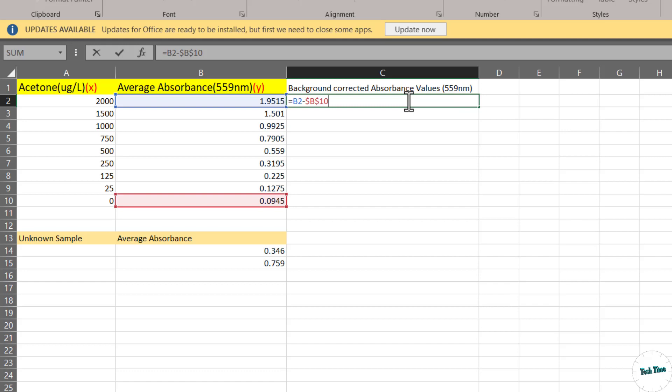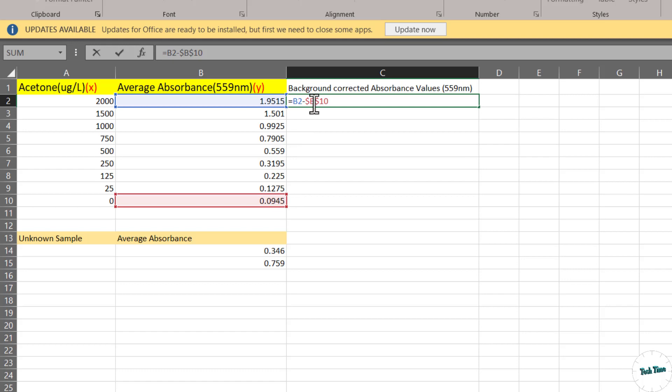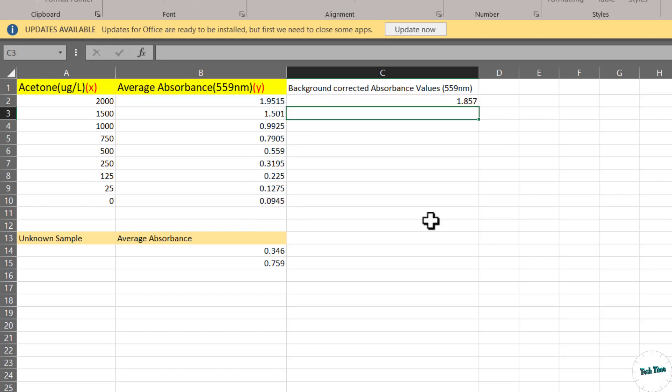The reason for inserting this dollar sign is to make this particular cell constant. If we don't do this, then using the drag function, Excel will take sequential values like if it's C B1, next it will take B2, B3 and so on. In order to fix this, you must use these dollar signs so that this particular cell remains fixed. Press enter and there we are.